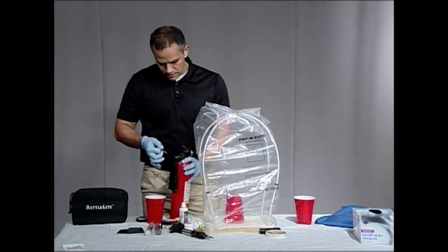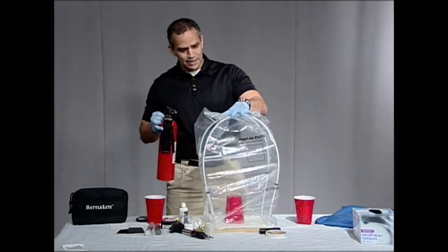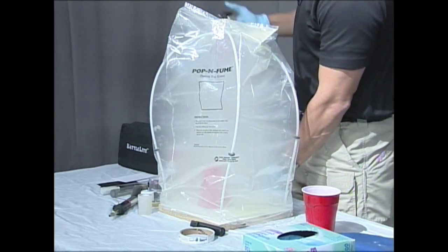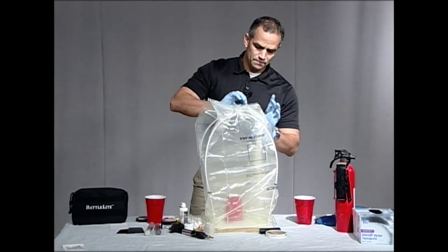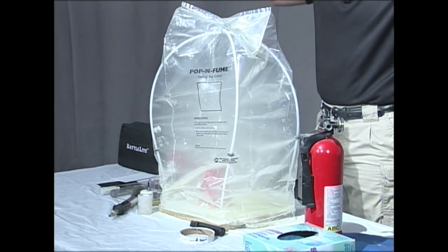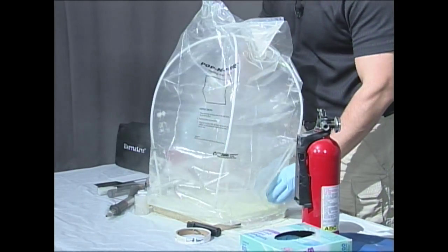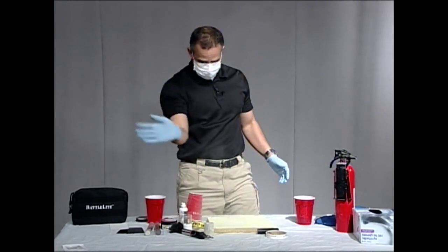So now what we're going to do is I'm just going to pull the end, make sure it's good to go, then do a quick burst inside here because this is a very small area. Again, if this were a large area, you could spray this thing like crazy. Here we go — I'm just going to put a quick blast in here, just like that. You can actually see up top there how fine that dust is. I'm going to put my mask on when I take this off. I'm going to take our cup out and break this down so you can see what I'm seeing. Look at all that — wonderful.